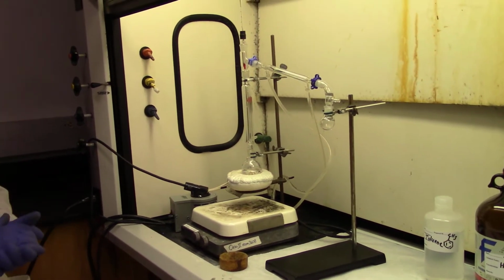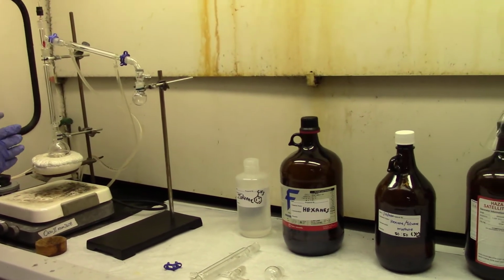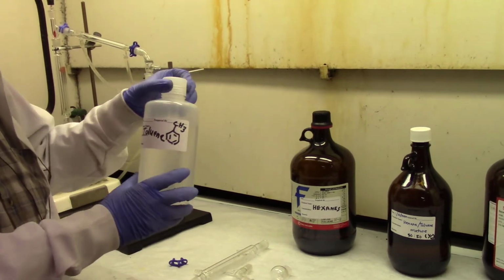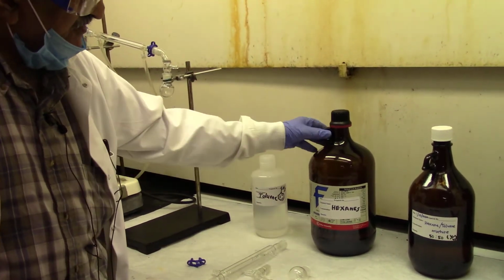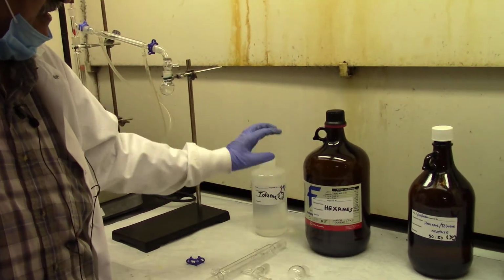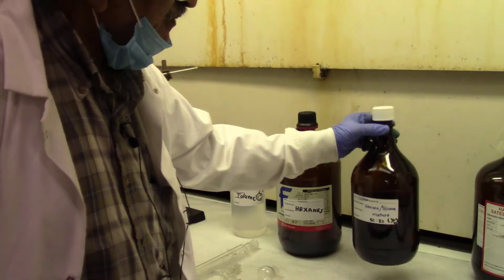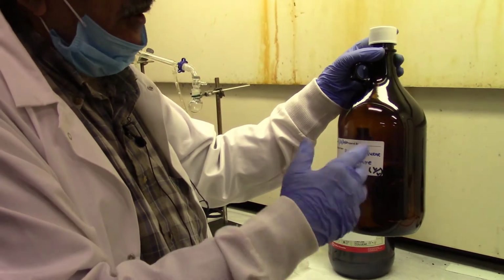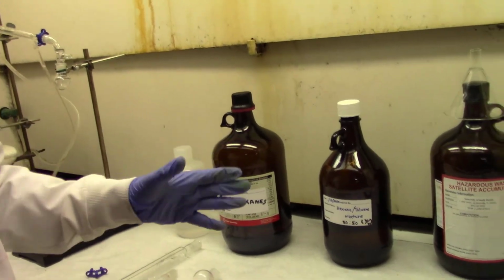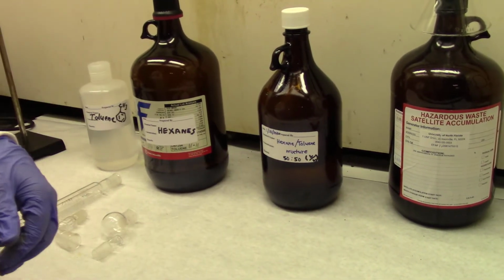So we are back here in the lab, and let me describe to you the components of this experiment. The two liquids are toluene, which is the higher boiling, and hexane, which is the lower boiling. The difference between the two is about 42 degrees Celsius. This is a 1-to-1, 50-50 mixture of toluene and hexane. This is the one that we are going to separate into its components. That's the mixture we will be charging the round bottom flask with.